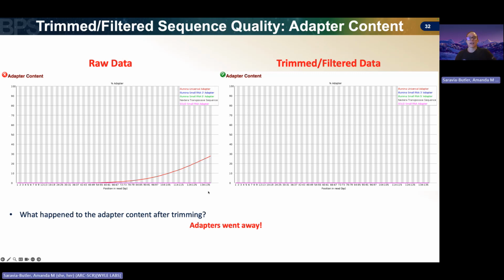And so that brings us actually to the end of part 1. And so before we get into the alignment step, which is our next step after our pre-processing or trimming, I'm going to pause here and have you guys go and start the RNA-seq processing Jupyter notebook of the hands-on portion of the GL4U RNAseq content. And you're going to go ahead and run the steps in that notebook through the end of your trimmed data QC, and then come back and pick up with part 2 of this RNA-seq overview lecture. I'll see you guys all then.